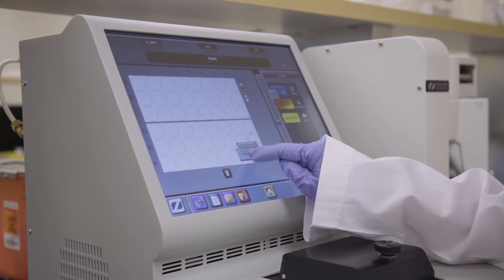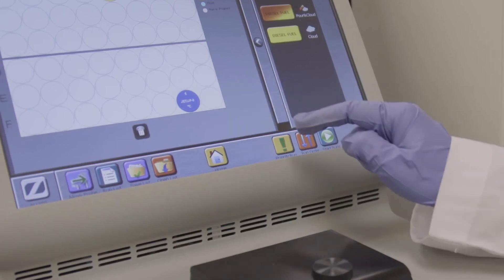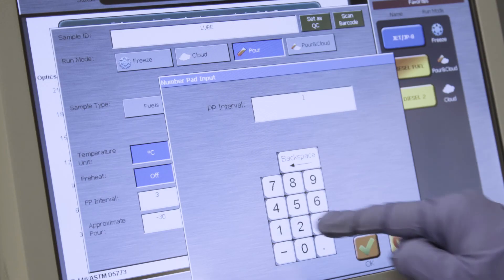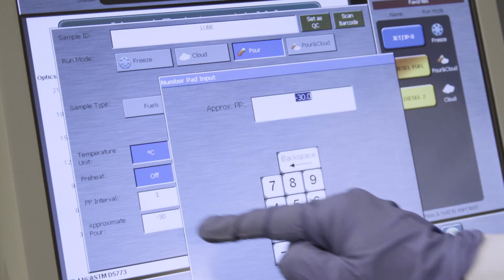Program test by dragging favorites buttons to the corresponding vial positions on the vial setup screen of the analyzer. Change sample ID and other test settings if desired.